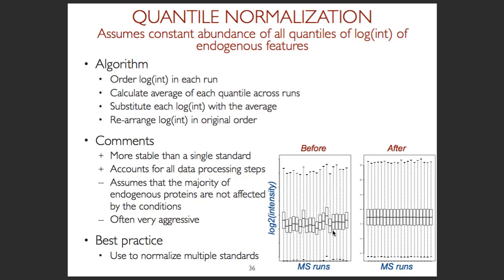And this is why experimental design is so crucial, right? This is why, as I was saying, you design the experiment best when you know how you will be analyzing the resulting data. If you know that you would need normalization, especially in long-running experiments where clearly you would need that, you will be much better off thinking it through and introducing additional standards up front. And of course, adding too many is difficult, they may be expensive, they may increase sample complexity. But one or two is usually feasible. And so this is something that you can think about upfront.